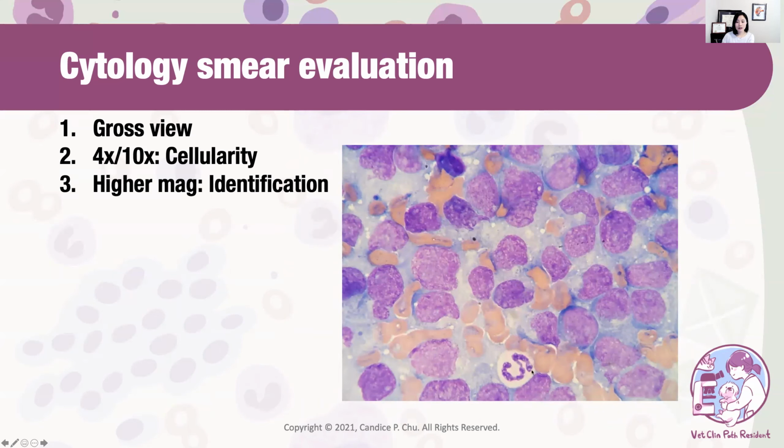So this is an intact neutrophil. This is an intact large lymphocyte. This is probably another intact large lymphocyte. And that's probably another intact large lymphocyte. Many other cells, there are actually lysed cells. So you will only be able to see the nucleus and there's no clear cytoplasmic border around the cells. So I would focus my interpretation only on the intact cells and try to ignore those lysed cells, or you will find a better location where you can visualize most of the cells and where most of the cells are actually intact.